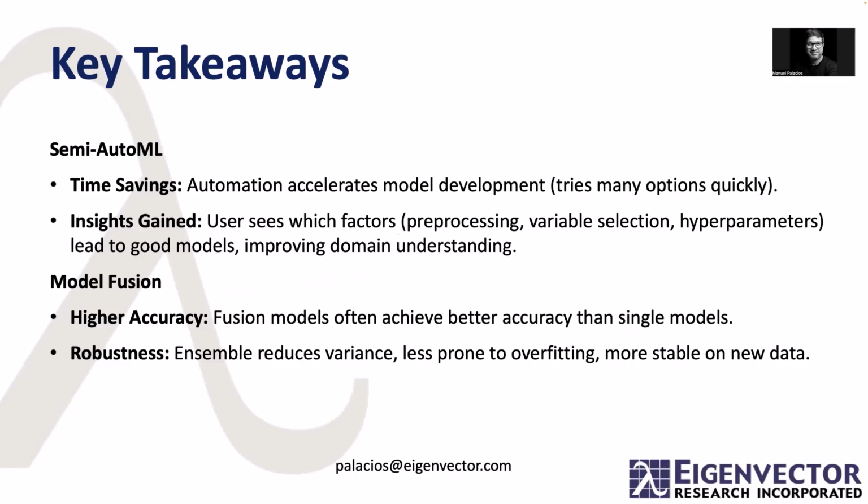All right. Yeah, key takeaways. Semi-autoML time saving. This automation accelerates model development because you can have a preset list of all the pre-processing recipes you'd like to try and just hit go, and it makes all these in just a couple of minutes. We also think that you gain some insight. You can see which pre-processing methods work.